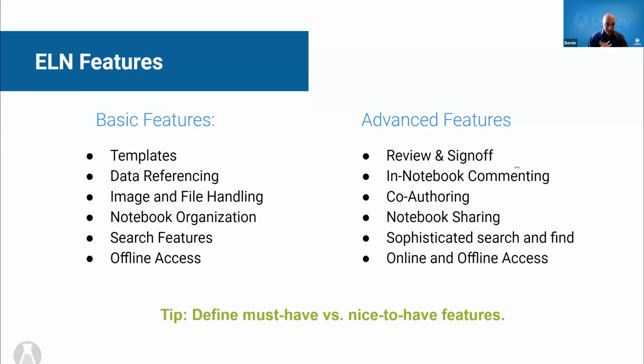First one I mentioned before is templates. They're a feature that allows you to pre-construct commonly written notebooks or protocols. The alternative, of course, is composing each from scratch, or more likely, saving text files on your personal computer to copy and paste from. So this one's a really big time saver.